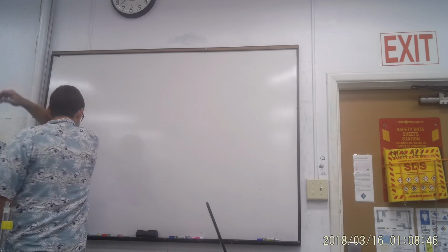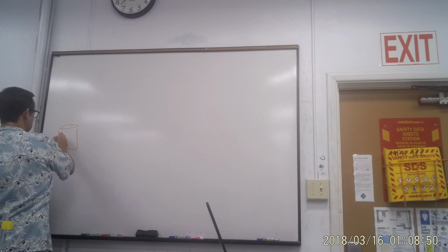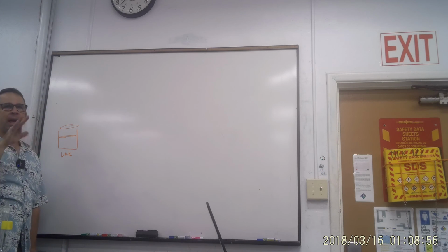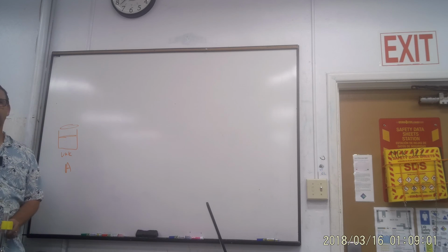Okay. So here I have a solution. It's my unknown. All right? It has A in it. Okay? I don't know the concentration of A. I need to know the concentration of A. All right?